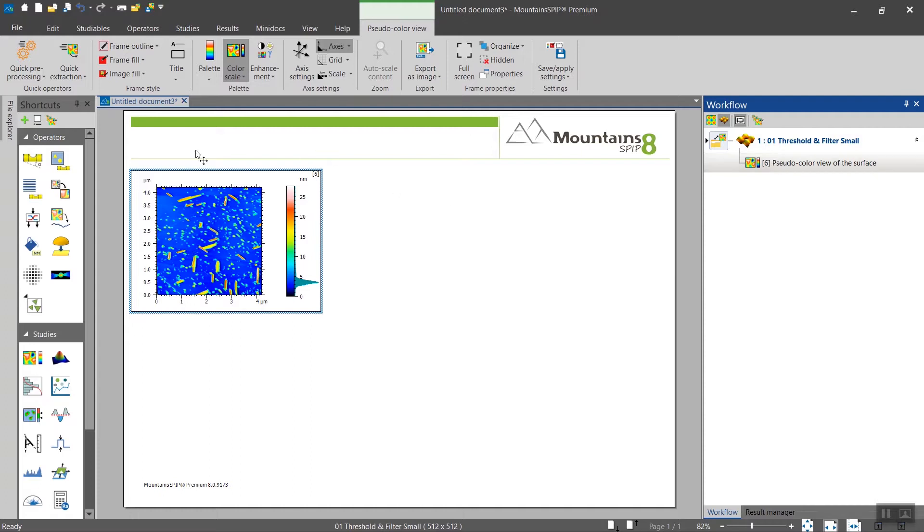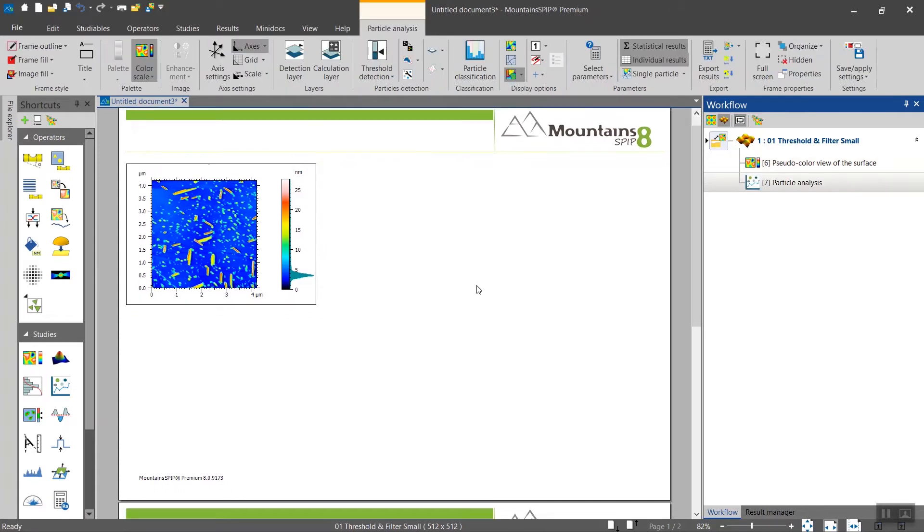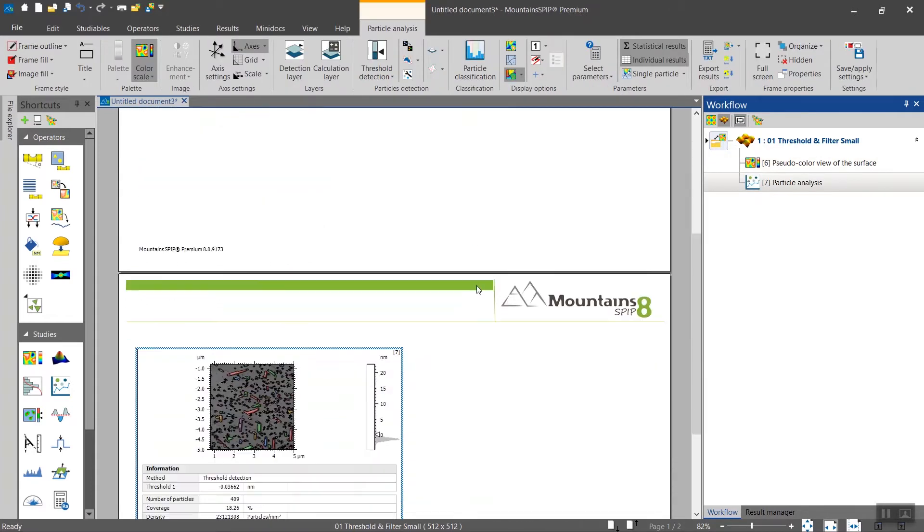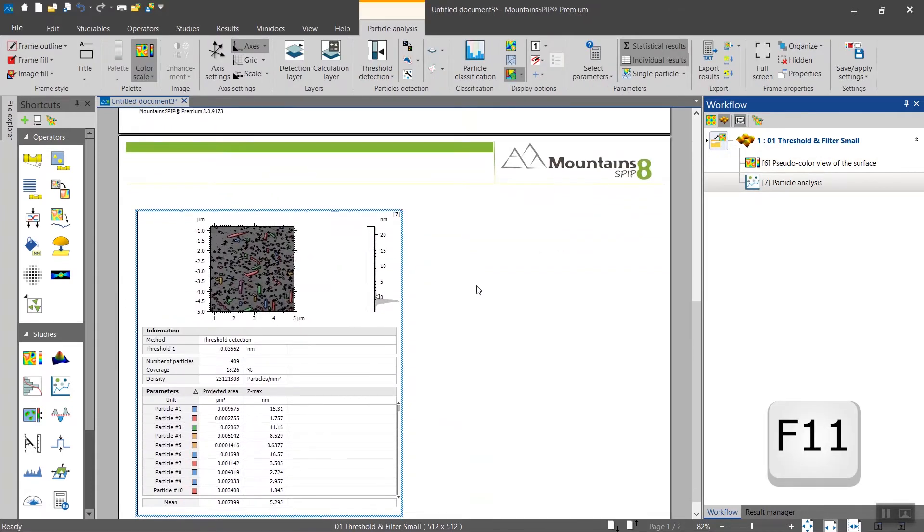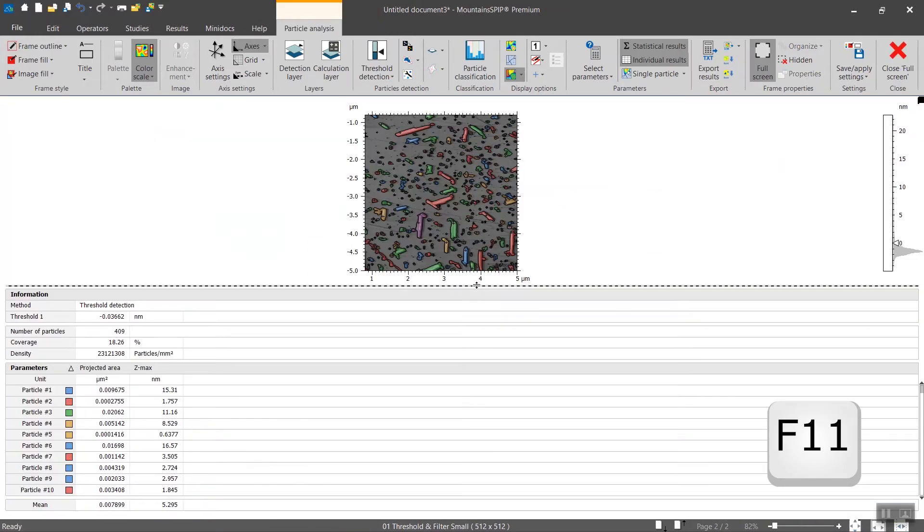You will find the particle analysis studies right here. You click on it and then I recommend pressing F11 for full screen mode.